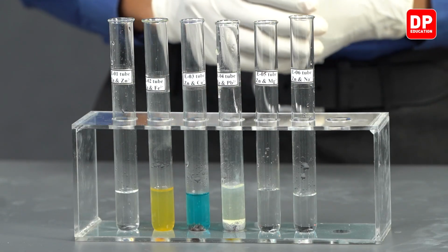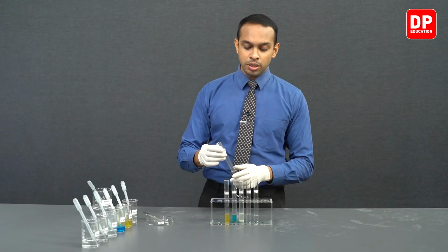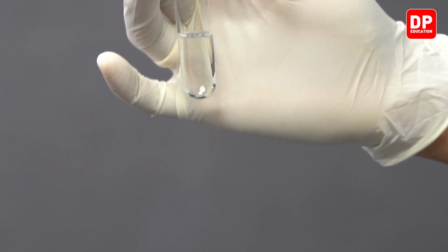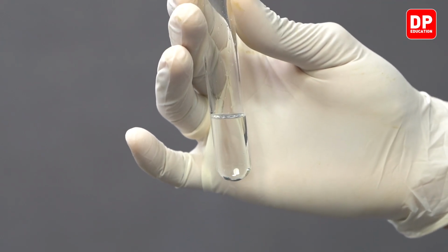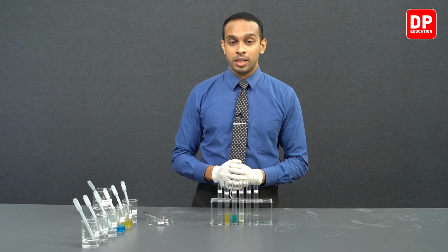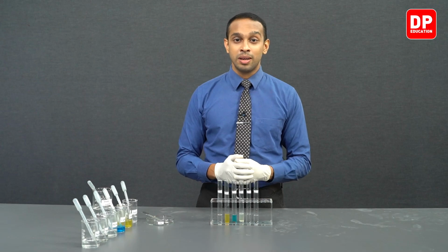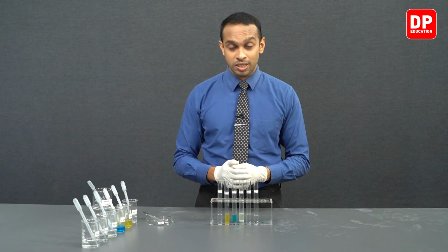Over here, what we have are solutions that are added with zinc metal. So let's take a look at the first solution. First solution is a solution where the Zn2+ aqueous ion solution was added with zinc metal. So students, over here we don't see any color change or any precipitate that is formed. So this is a very clear observation that Zn2+ will not get displaced in the presence of zinc metal. Zn2+ is the positive ion of zinc metal. So therefore, Zn2+ will not get displaced with the aid of zinc metal.